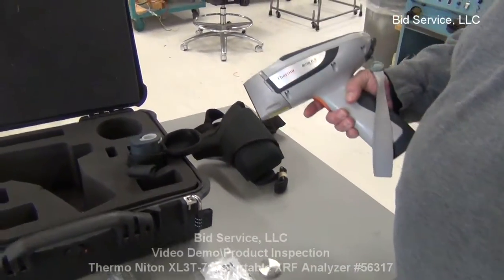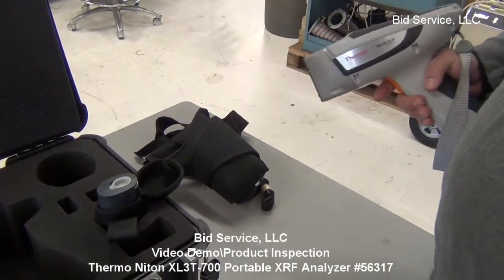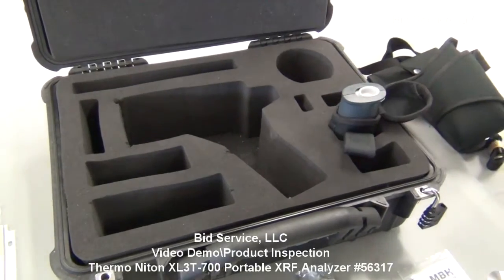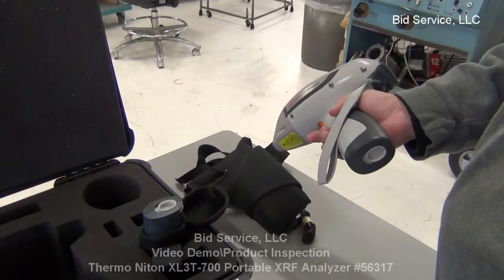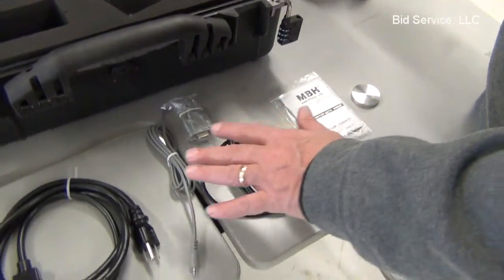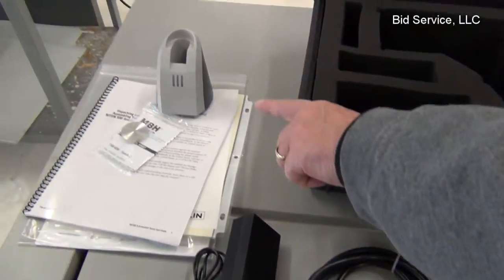Here we have the Thermo Scientific Niton XL3T. The case comes with an extra battery. The other battery is located in the bottom here — just clips and pulls out. It comes with all the data cables necessary, a charger pack, and the charger base for the other battery.